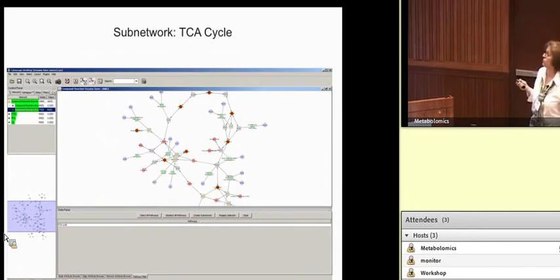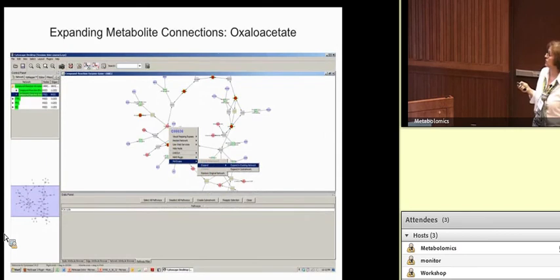And there are various visual features to show the metabolites that are up and down regulated. Similarly, you can load genes and visualize these. And I mentioned to you that this particular study is a time course, and you're going to see tomorrow how you can view these changes over time.